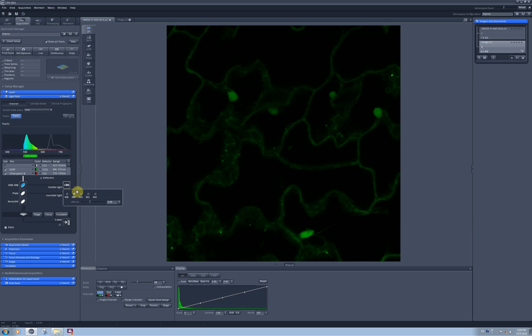But apparently this laser line can also excite fluorescence of chlorophyll. As you can see here the spectra of GFP and of chlorophyll slightly overlap.